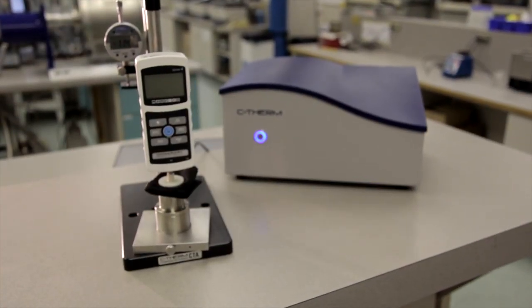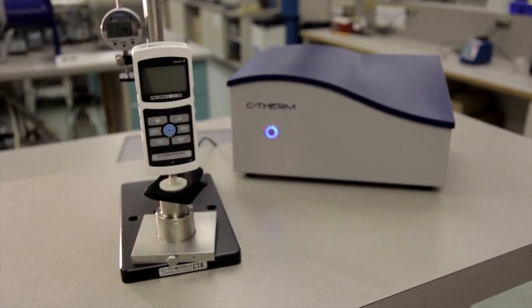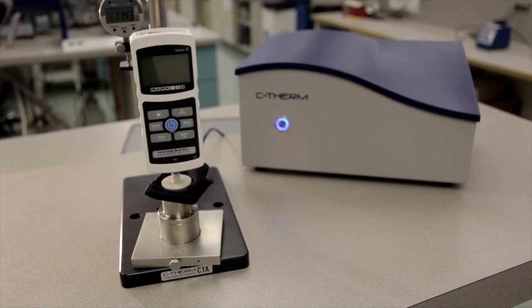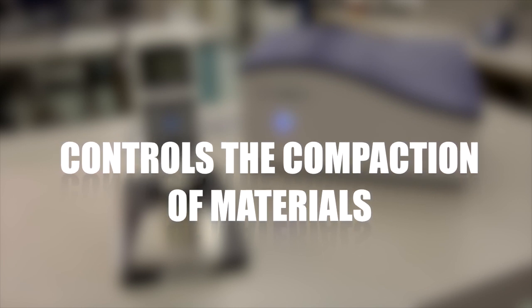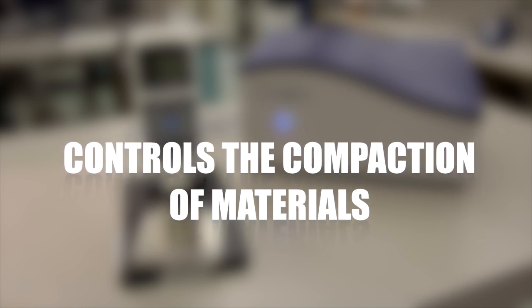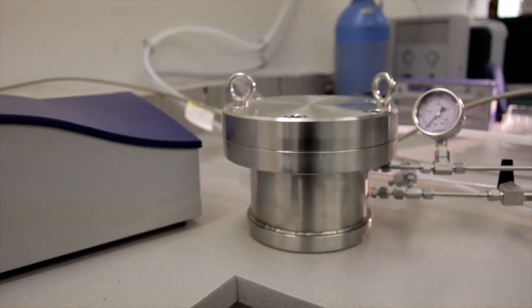The compression test accessory enables researchers working with textiles, thermal interface materials, and powders to precisely control the compaction of such materials. The precise control offered by this accessory is critical in obtaining accurate representative data.